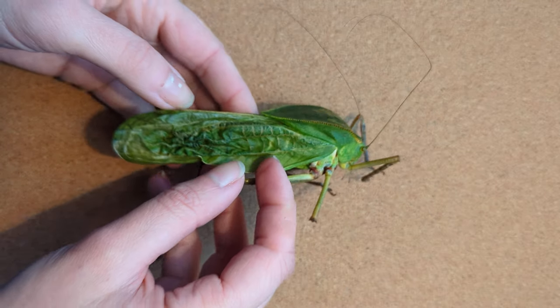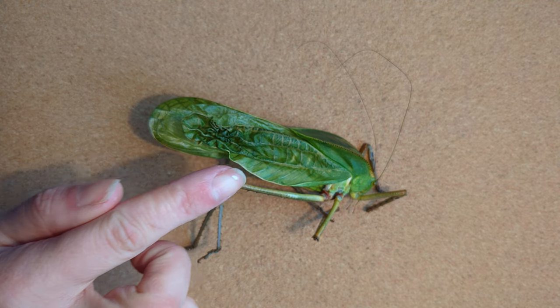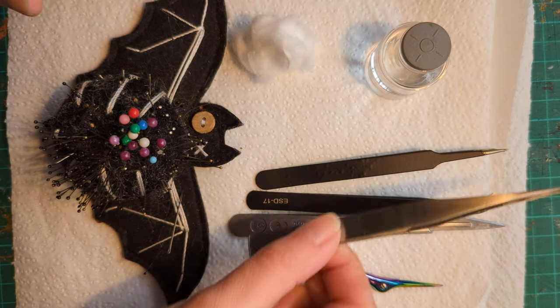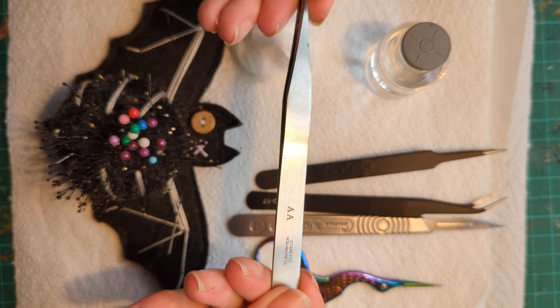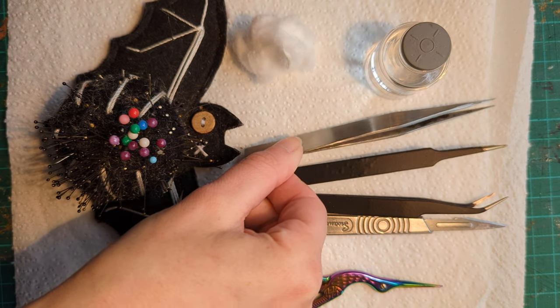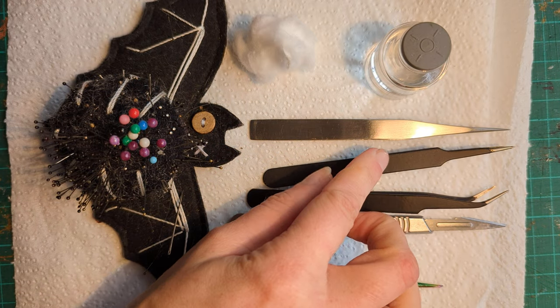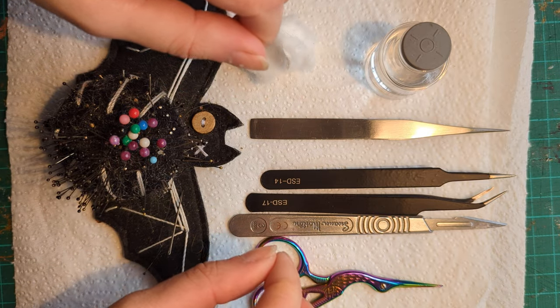I'm going to show you the equipment I'll be using and then we're going to clean him and pin him. I have my favourite trusty tweezers — these are AA beading tweezers. I've had these for a number of years; they are my be-all and end-all. I use these for basically everything, and I do have another couple of tweezers as backups just if I need to be using both hands.